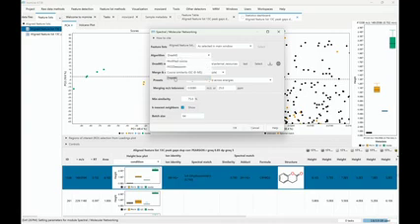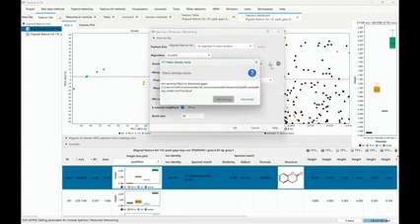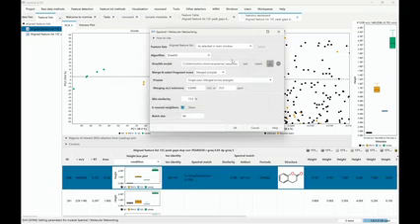You're going to see that there's the DREAMS model, there's MS2 Deep Score, there's the modified cosine. And if I want to use DREAMS, I only click on the download button. For me, it's going to tell me that I already have this model. I say use existing. And otherwise, it's going to download the model, and afterwards you can just click OK, and it's going to score by DREAMS embedding and cosine similarity. It's going to score the similarity of all these spectra. And in the interactive visualizer, you're going to see both edges from the one score and the other score, and you can toggle them on and off. You can see it is maybe connected by one and not the other, because they are kind of orthogonal.